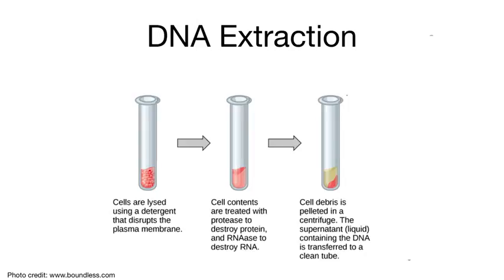Although it's not necessary, many people do DNA extractions using special kits they buy from laboratory supply companies. These kits include all of the chemicals, tubes, and filters necessary to complete an entire DNA extraction and speed up the process substantially. Now that we have the DNA, we have to make copies of the region that we're interested in.